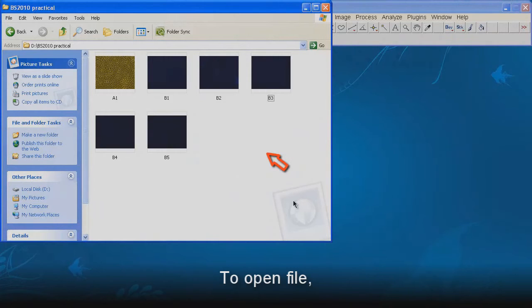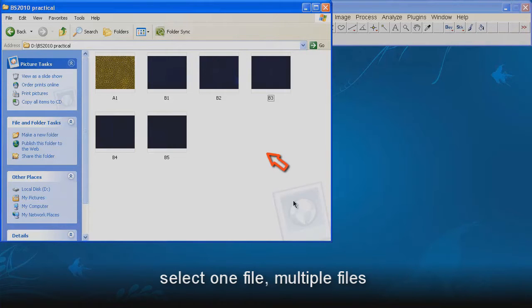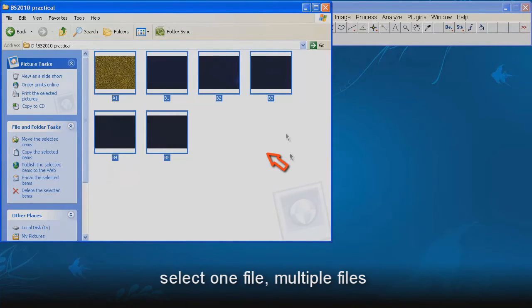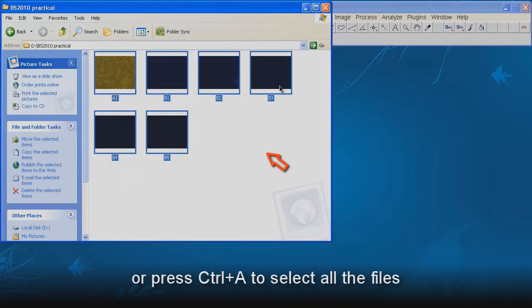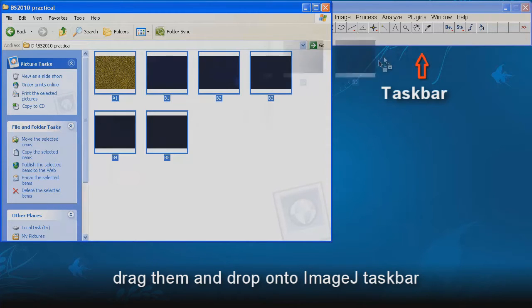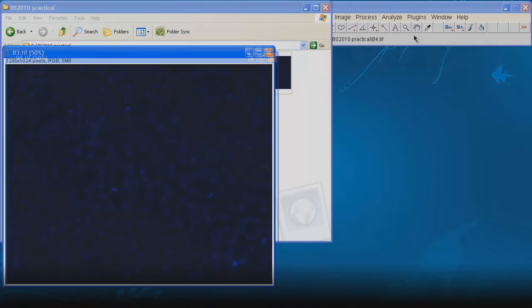To open file, select one file or multiple files or press Ctrl-A to select all files. Drag them and drop onto the ImageJ taskbar.